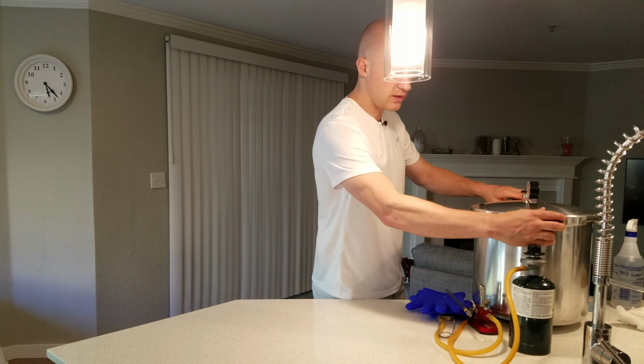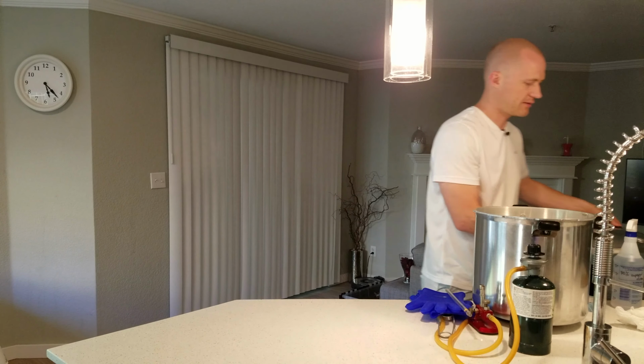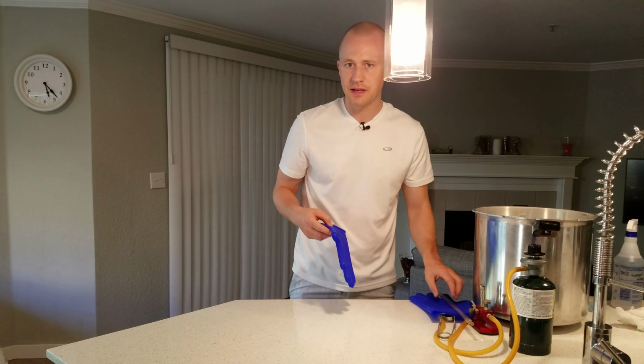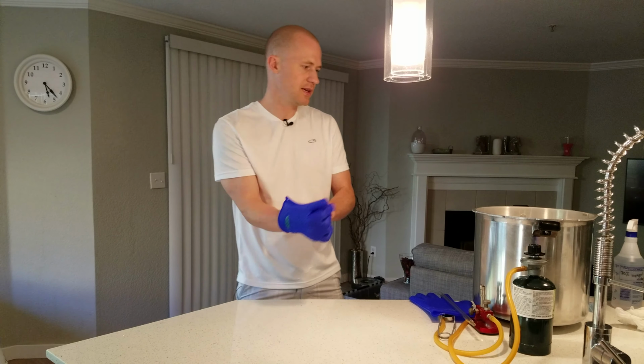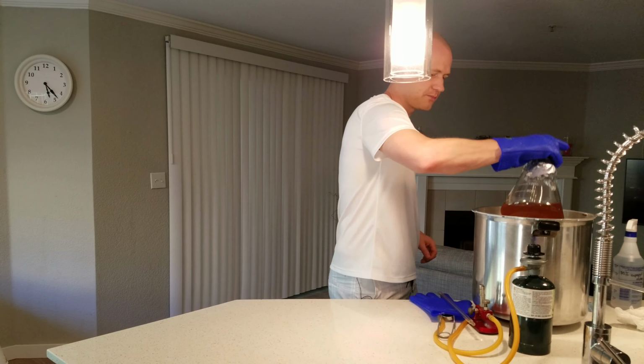Next thing we're going to do is to take out the tubes for the slants. The agar in the Erlenmeyer flask has to cool down to body temperature before we can pour it into the plates. But the tubes are already poured, so that one we can go ahead and start with.